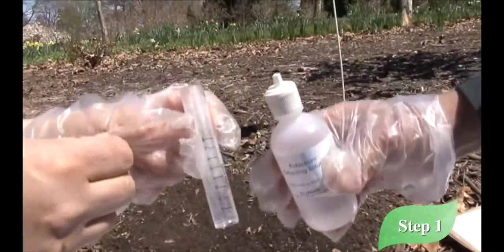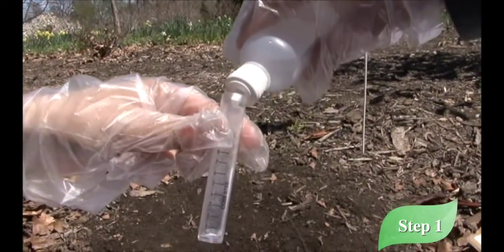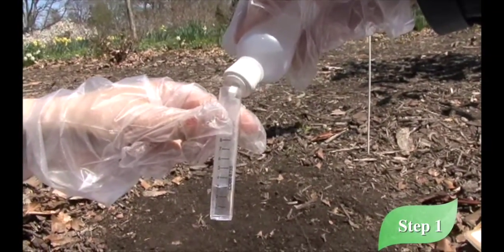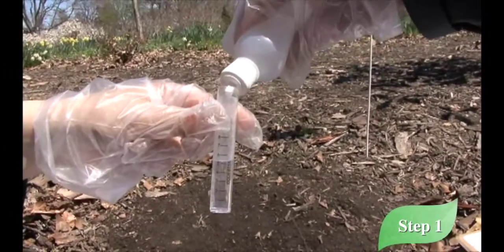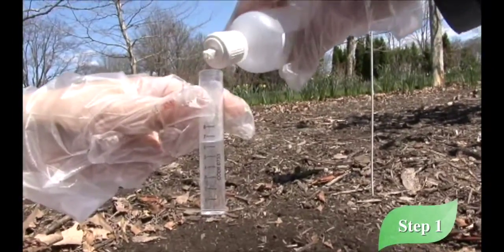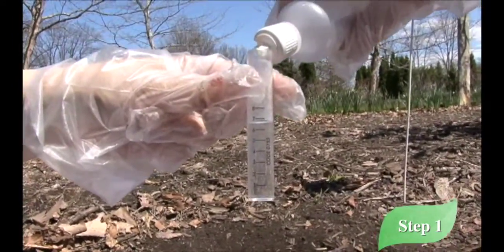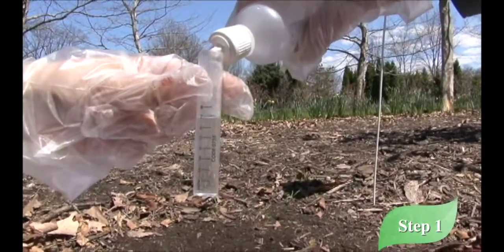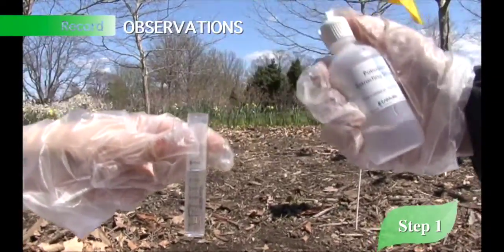Now remember, you're going to have to squeeze really slowly. We want to make sure we get the smiley face or the meniscus. Exactly, and we have to look at it exactly at eye level. Keep going, we're not quite there. Go really slow near the end so you don't overfill, because you'll have to pour it back into the bottle if you do. Excellent. There you are.